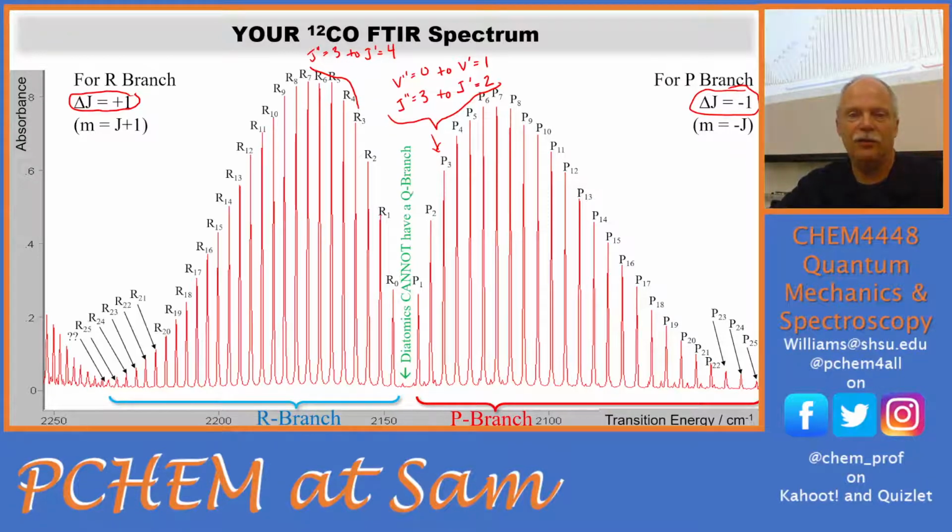And then we have R4, 5, 6, 7, all the way up. And here we're actually running into the carbon dioxide spectrum. So it gets confusing. These peaks are from carbon dioxide. And so you kind of get into a forest of peaks over there, and you have to make sure that you're looking at the ones that are decreasing and getting closer to the noise.